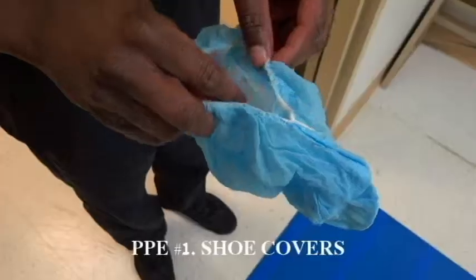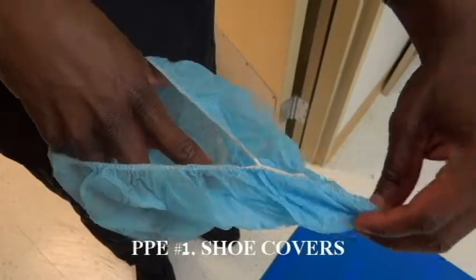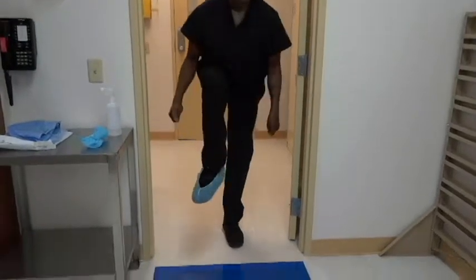Don shoe covers. Slip the tip of your foot to where the seam covers your toes and the back portion covers your heel. Place foot with the shoe covers on onto the sticky mat.